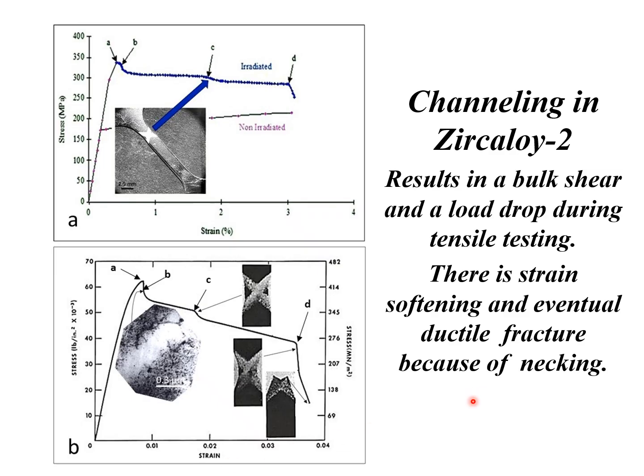So what is the characteristic of channeling? Well, and twinning, in fact. Any kind of bulk shearing basically gives you a large strain jump at a particular point when either the twinning or the channeling occurs, and what that corresponds to in a tensile test is a load drop. So if you have a tensile rig, a load frame, and you're pulling some samples to failure, whenever some of these channels form, you get a load drop.